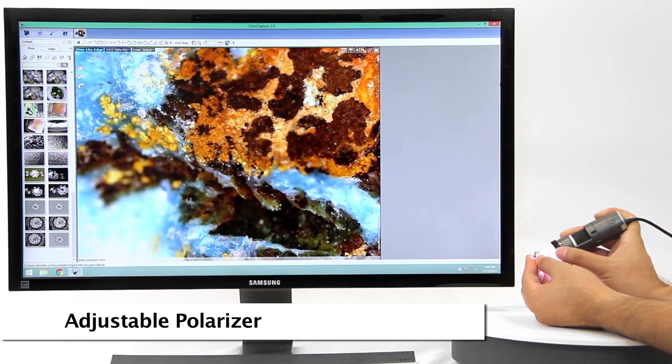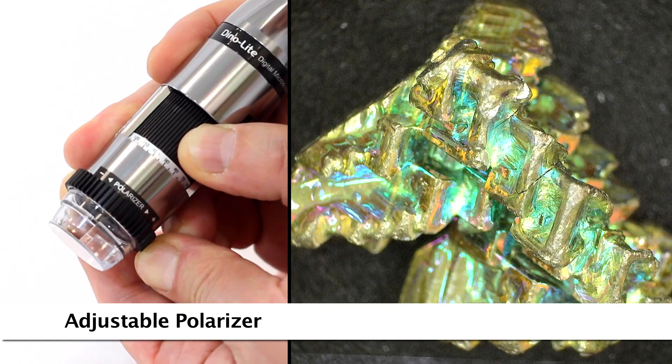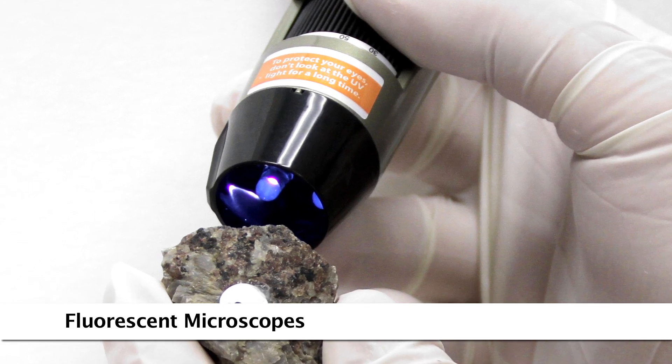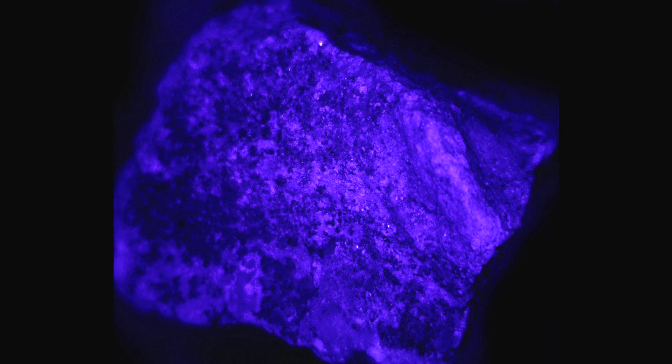Some models have a built-on adjustable polarizer that help to provide more clarity and different results in imaging. There are many fluorescent models to choose from in various wavelengths.